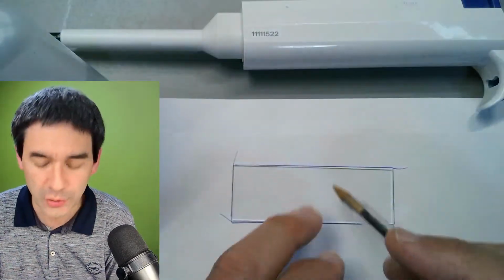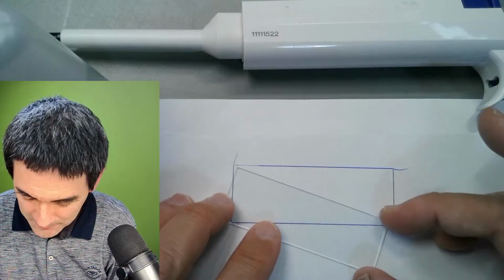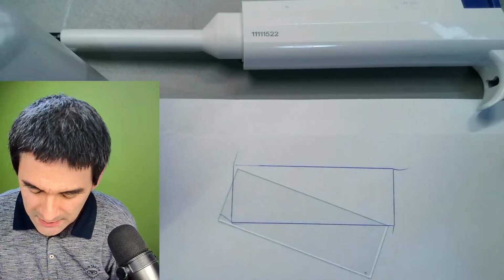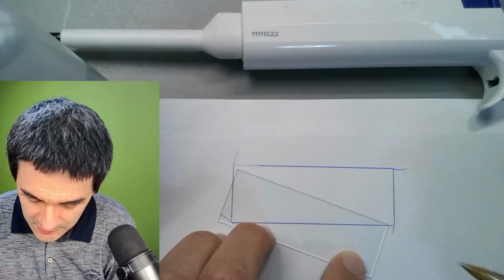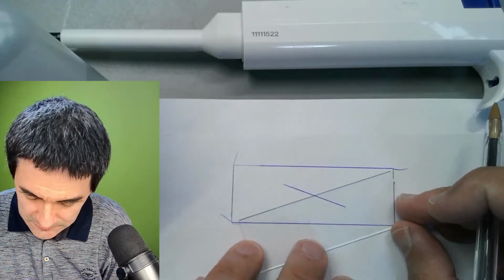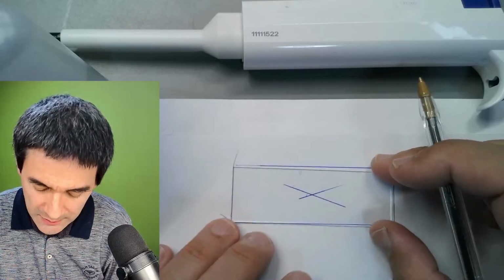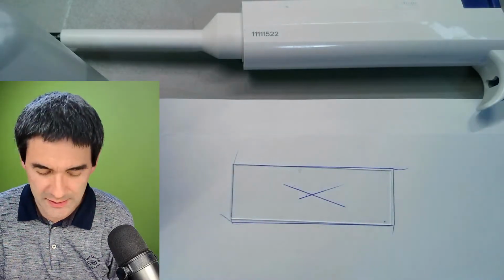I should not have touched it because now it's greasy. I'm going to simply mark the center approximately here. Sometimes it's going to drift anyway a little bit. So I think that's much better like this.